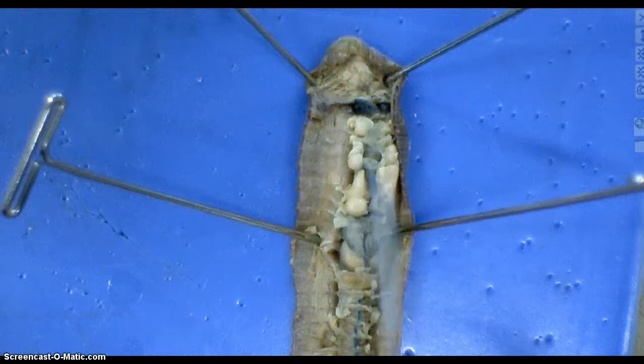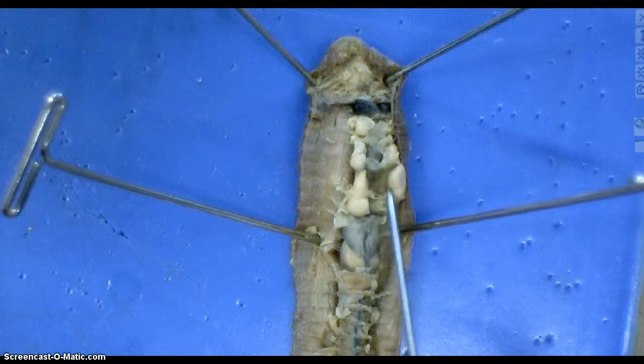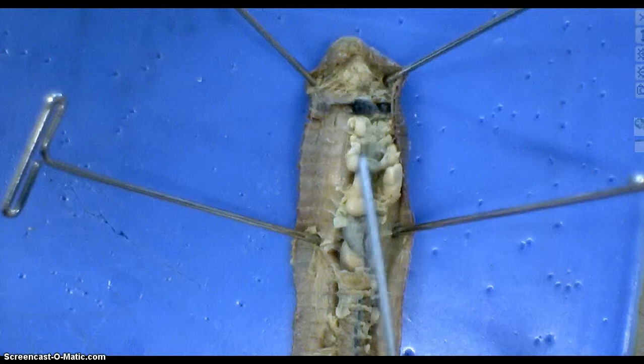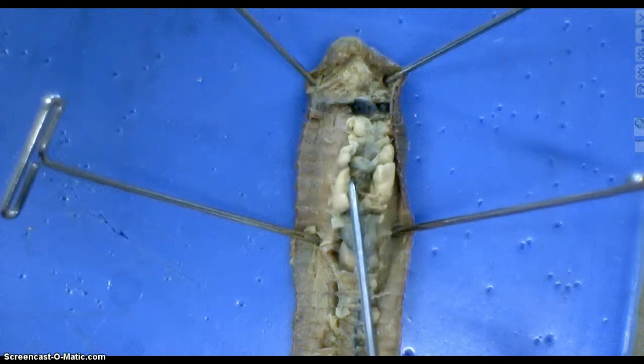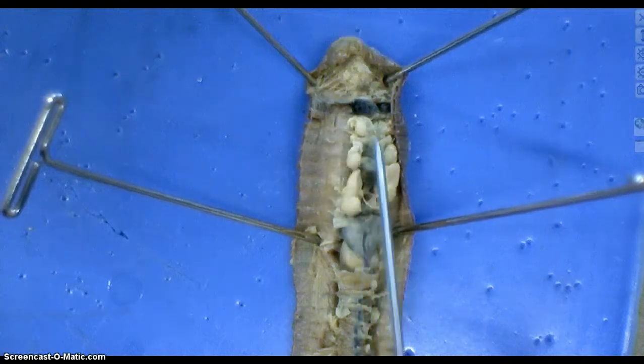These white structures here are various parts of the reproductive system, and you'll have to use your notes to figure out which is which. That means you actually have to read the lab.